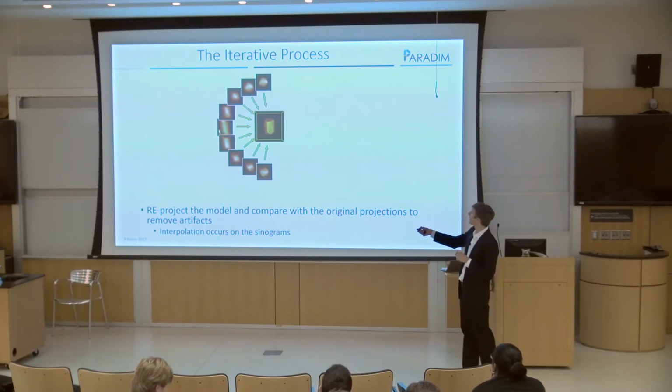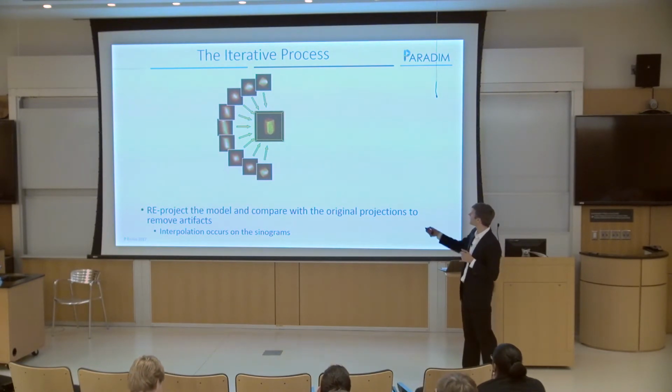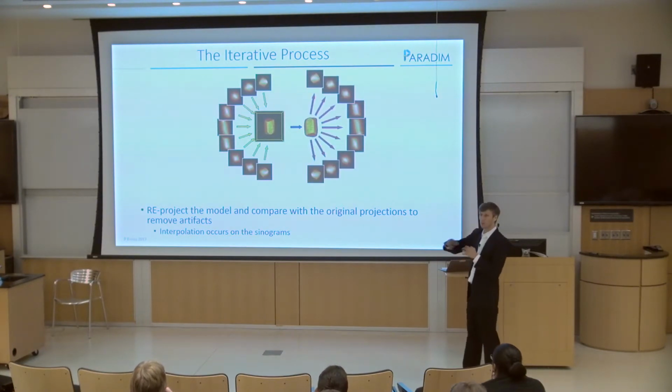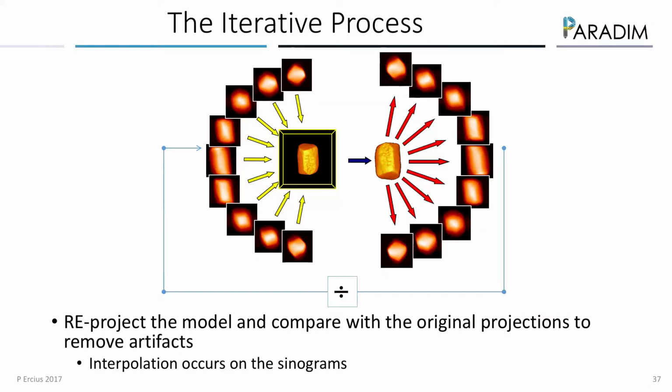So we take all of our projections, we reconstruct something using back projection, okay? Since this is a set of intensities or voxels that are in our microscope, we can actually take this reconstruction, right? And we can project it again. We can do a simple operation where we just sum all the voxels along a certain direction. And we can create a new tilt series, right? We generated from our three-dimensional thing. It's all in the computer, right? So then we can compare how these projections match to our original experimental data.